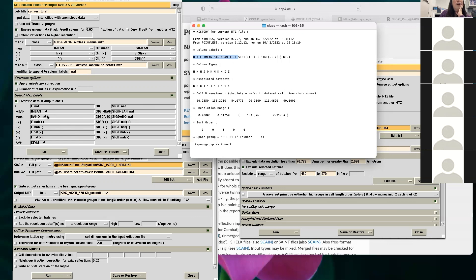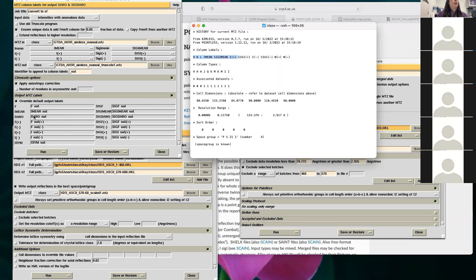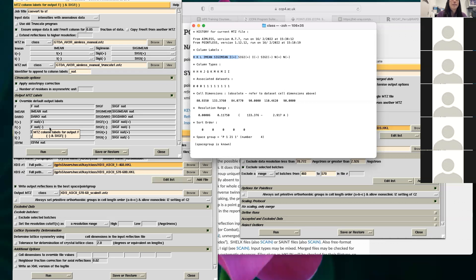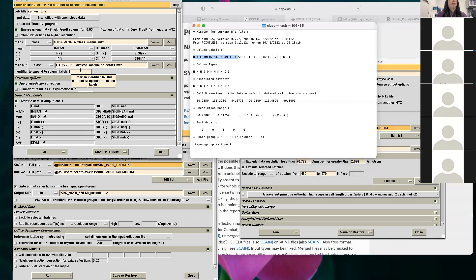If you ever wondered: DANO is anomalous — instead of separating into I+ and I−, all the information is together as one merged number. And you can see it's keeping the anomalous information separate with F_nat_plus and F_nat_minus. If you don't want anomalous, you can delete those columns — and then they're gone.